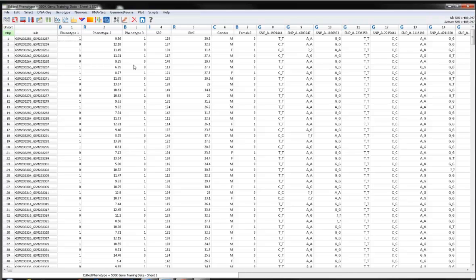Now, the interesting part about using mixed model analysis in GWAS is that the mixed model tools that we incorporate use a kinship matrix to explicitly account for the pairwise relatedness between all sample pairs. And because of that, what we'll need to do as a workflow is start by selecting an informative subset of SNPs, calculate a kinship matrix, and then proceed with our mixed model analysis.